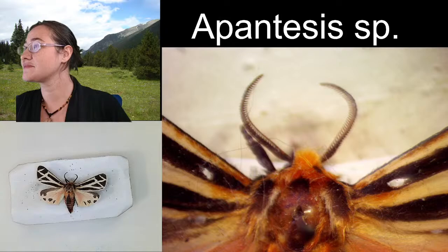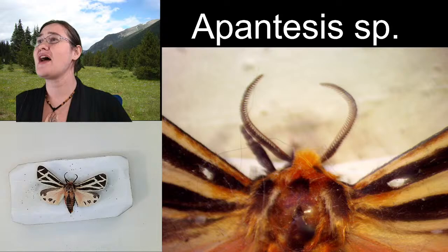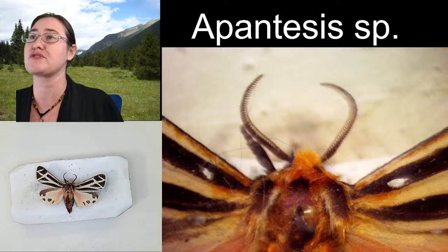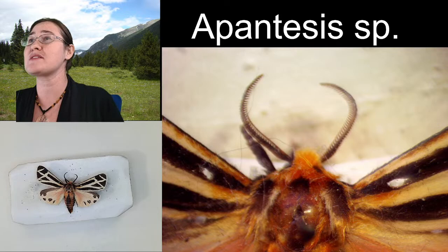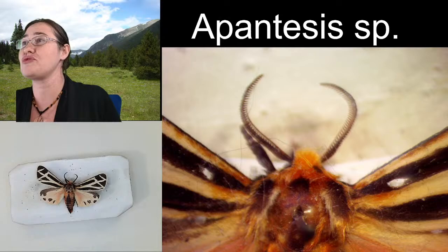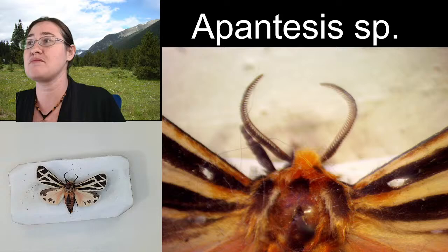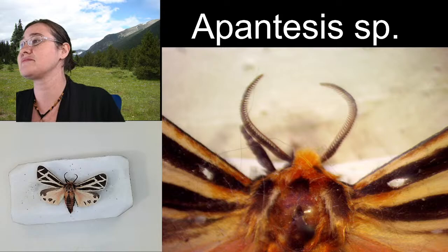And it's possible to see, there are a couple of different species that have this same kind of black and white striping on the front wings and the pink hind wings with a varied number of spots on the hind wings. This specimen was collected in Michigan in 2010, and from a quick glance of specimens that are common in Michigan on iNaturalist, there are four species that are all very similar.